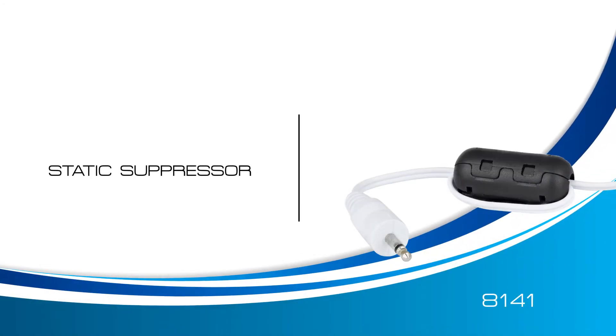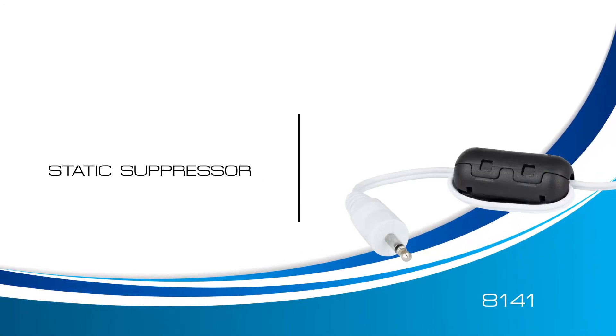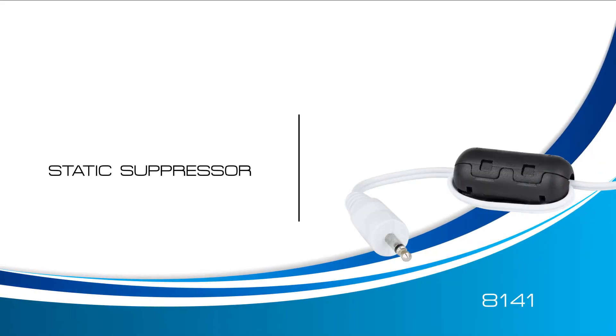Welcome to a Traceable Products instructional video for the 8141 static suppressor. In this video, we're going to learn how to properly install a static suppressor.